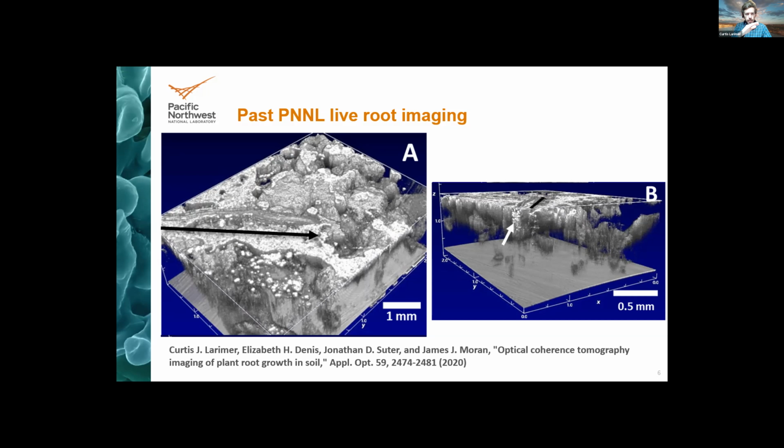And taking that same image and tilting it so you're looking at the edge, you can just see the end of that root and even some of the cell structure around the sides of it visible in the side of the image.